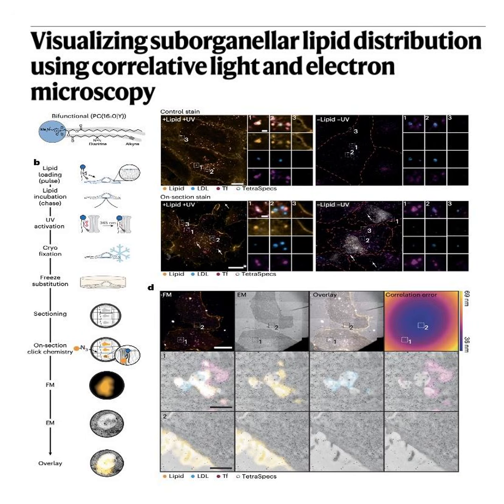That's the perfect way to look at it. Yeah. Which brings us right to the operational challenge. We have the invisible stealth probe, but how do we actually capture it on microscope camera before it zips across the cell? Right, because it's still moving incredibly fast. This is where the methodology gets really cool. To help visualize this workflow, let's use a mnemonic device. Think of it as the LCFC algorithm. LCFC. Yeah. Load, crosslink, freeze, click.